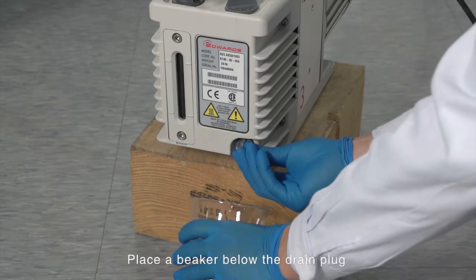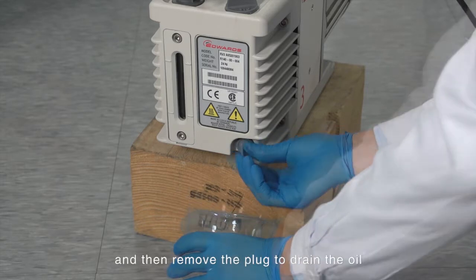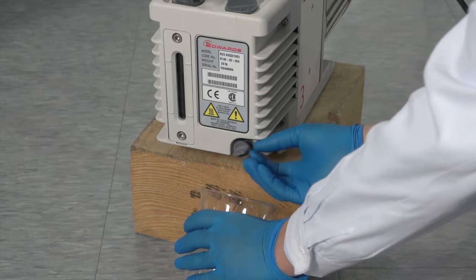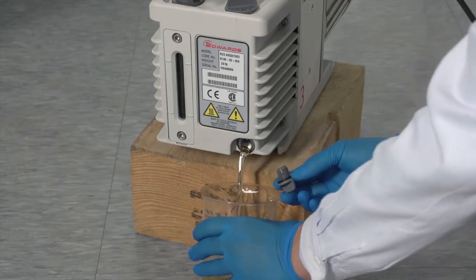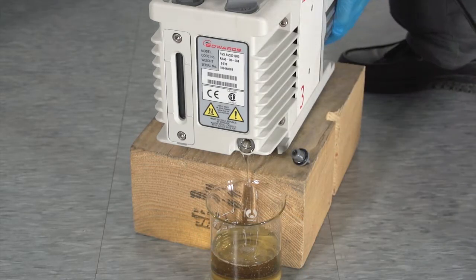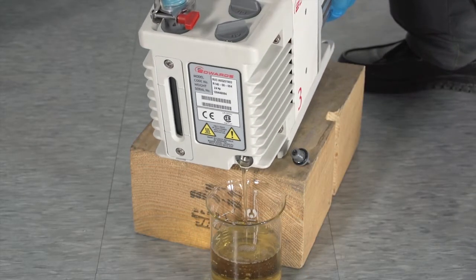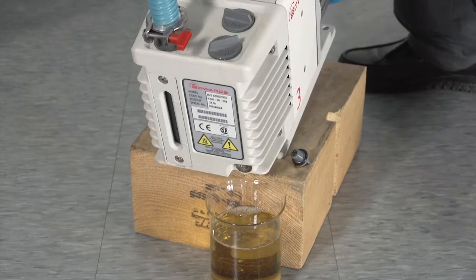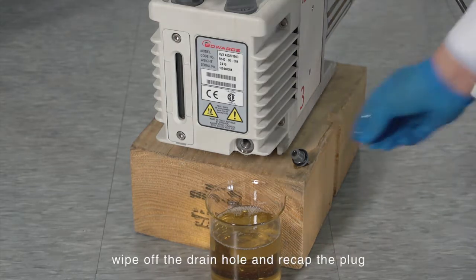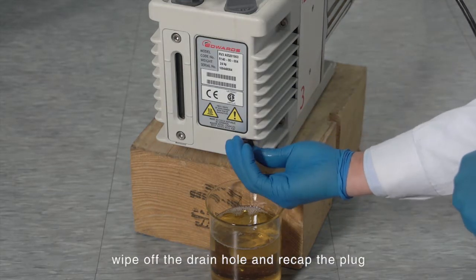Place the pump high enough to drain the oil. Place a beaker below the drain plug and then remove the plug to drain the oil. When the oil has completely drained, wipe off the drain hole and recap the plug.